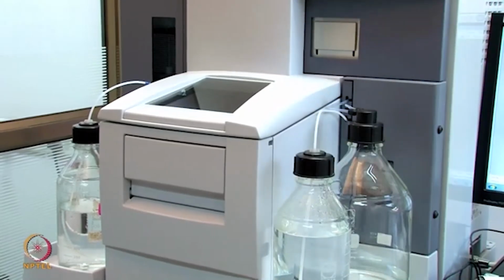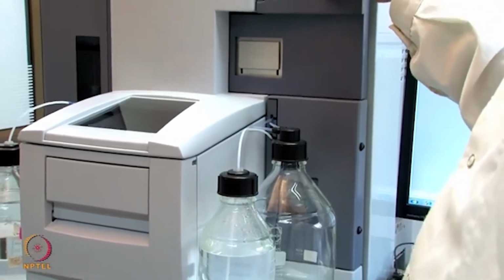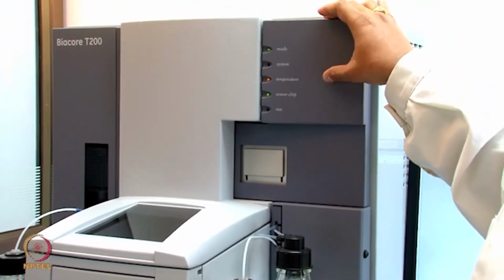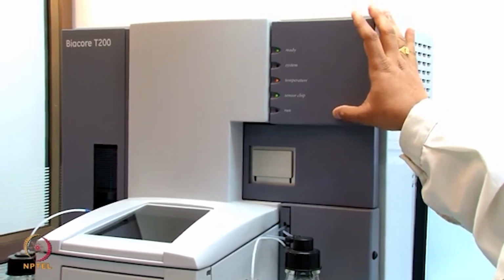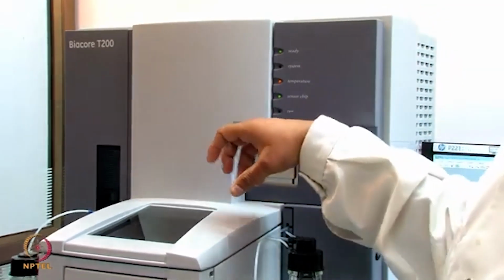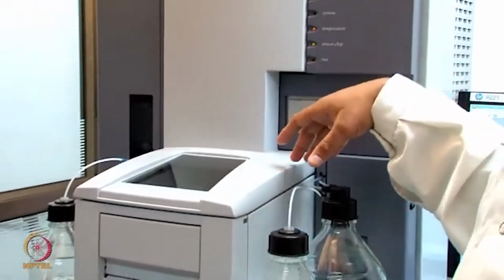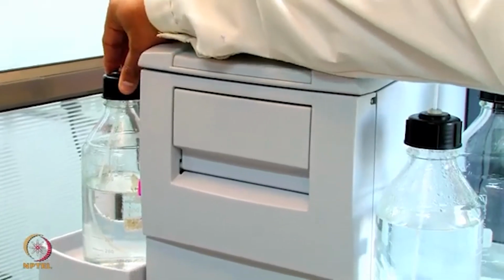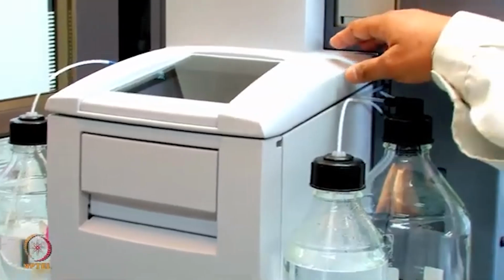recorded on the screen. Here are some indications provided when the machine is ready or the system is calibrating the temperature, when the new chip is docked and the run is actually happening. So we will now connect a new running buffer here and prime the system before our immobilization experiment. So here the new HBS-EP plus buffer is connected and the new chip will be docked now.